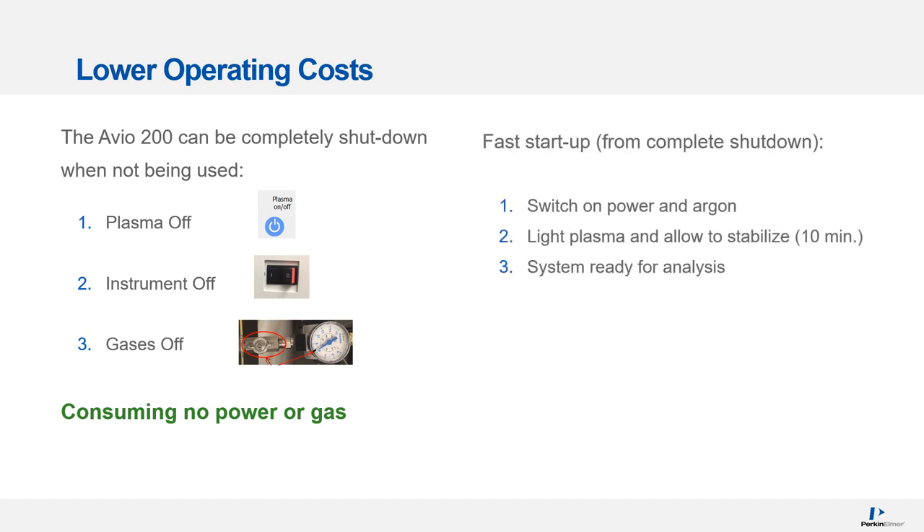To start up from a complete shutdown, it's essentially the reverse: switch on the power and argon, light the plasma, and allow it to stabilize for about 10 minutes. Then the system is ready for analysis.